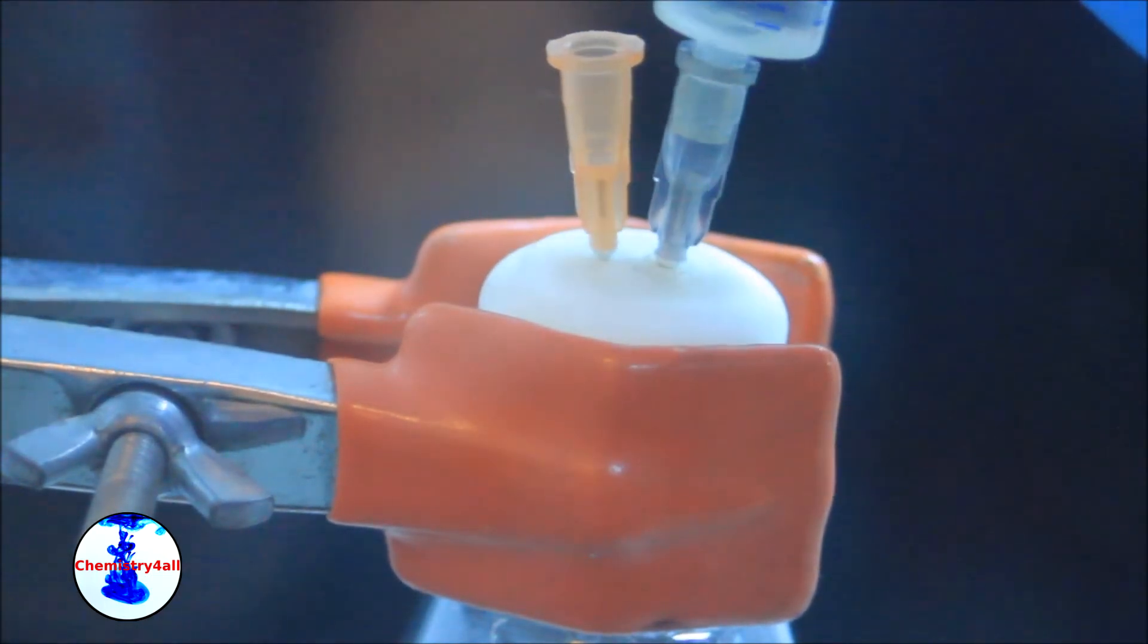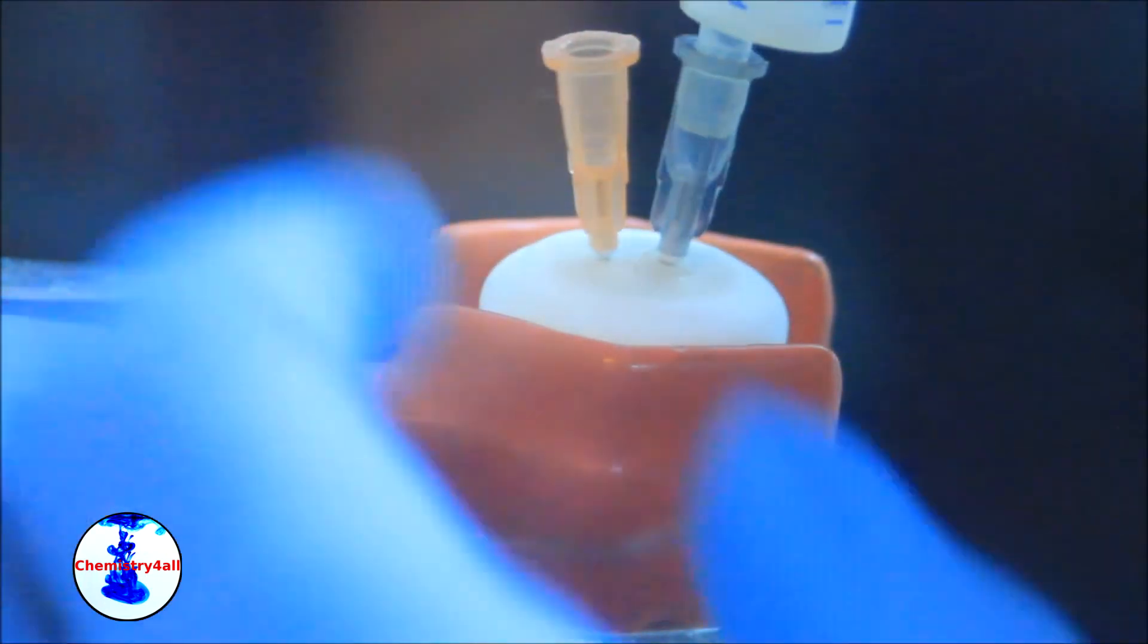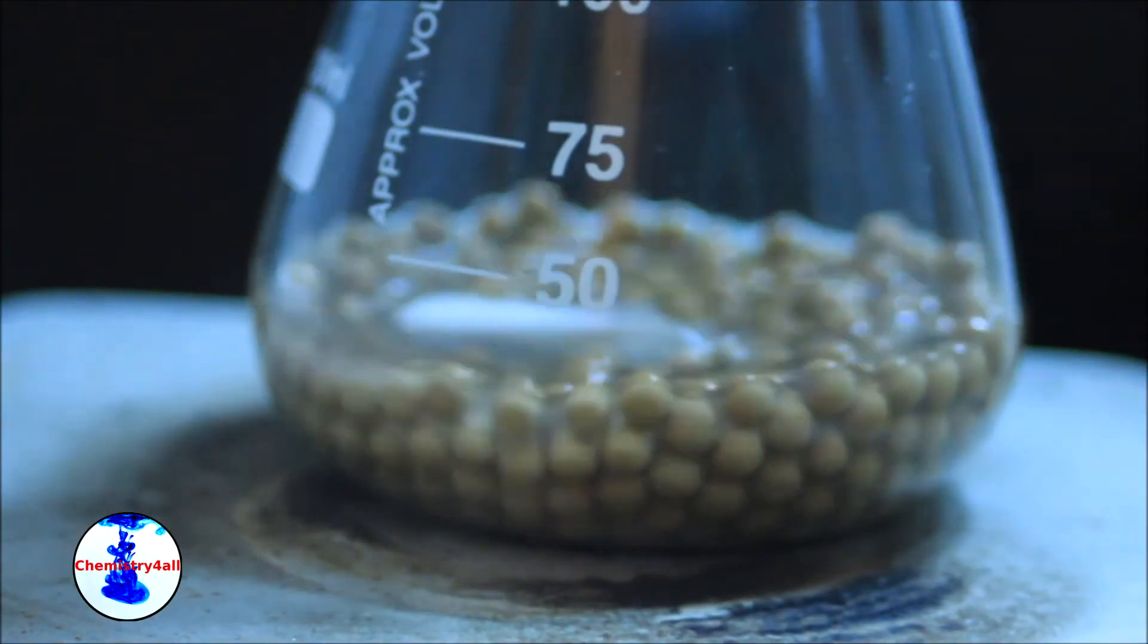Finally, we pour the ethanol into the flask itself. The amount of ethanol used should be about three times greater than the net volume of the molecular sieves used.